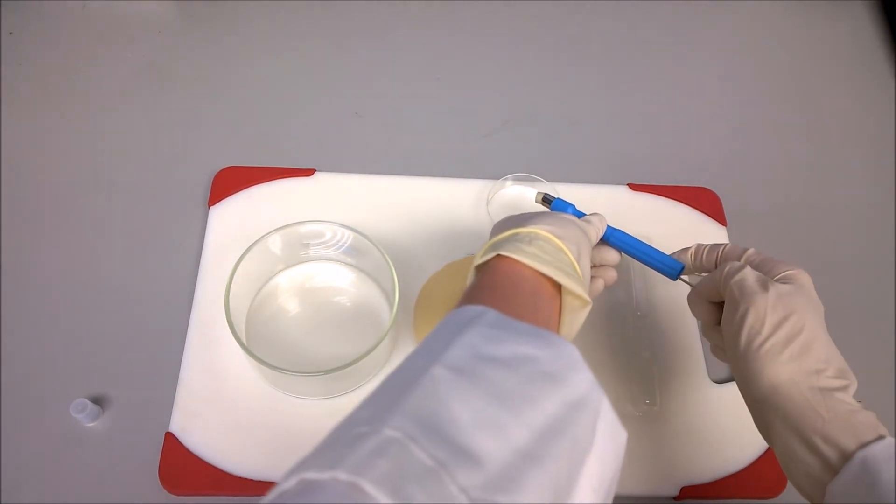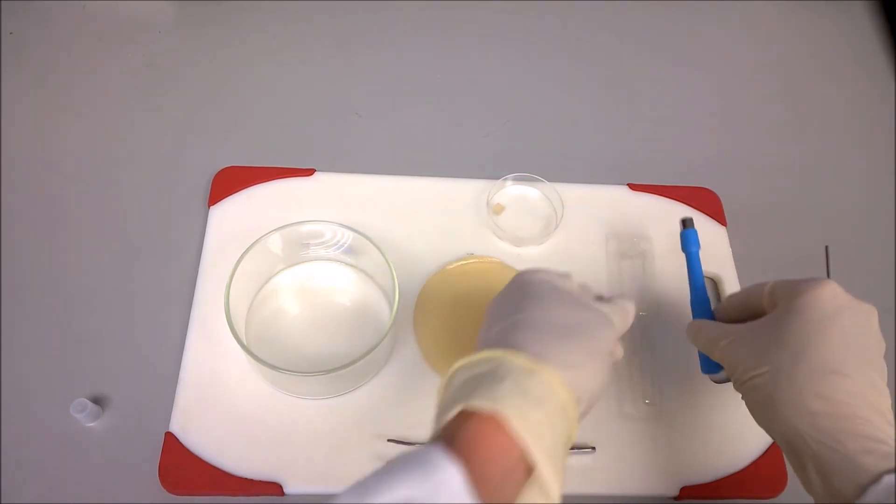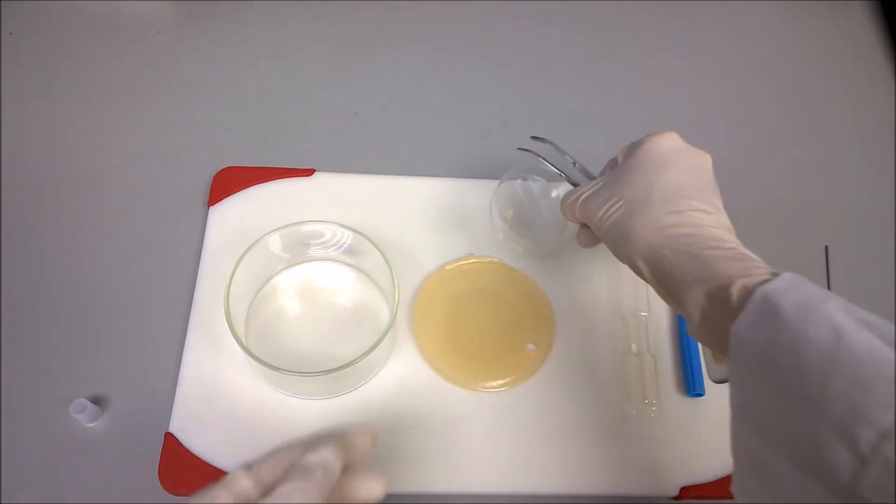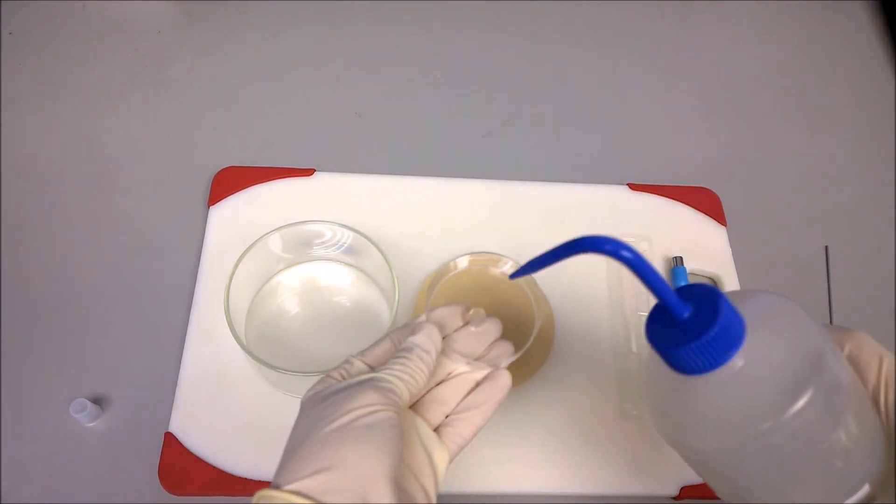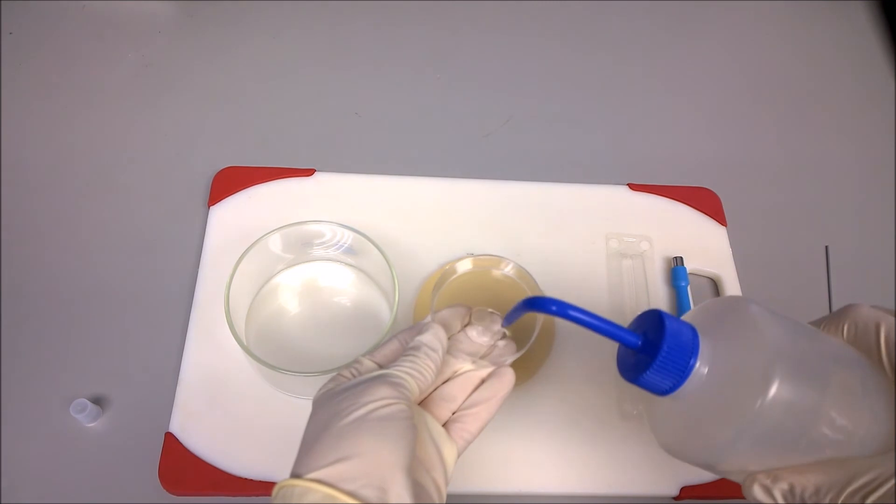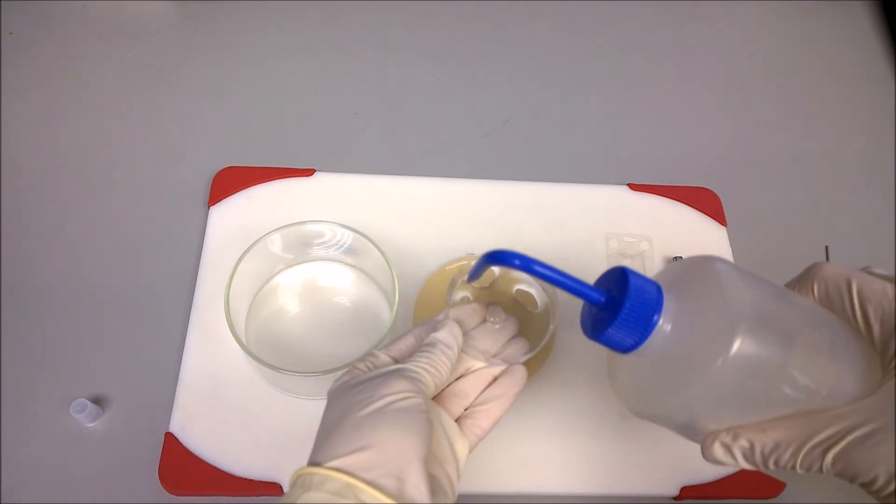Ensure that the plastic disc is removed before performing mechanical tests. Store hydrogel discs in deionized water. Repeat those steps twice to obtain 3 hydrogel disc shaped samples.